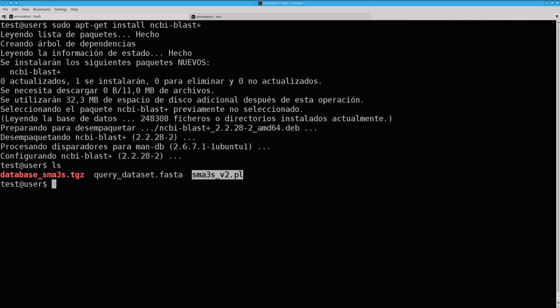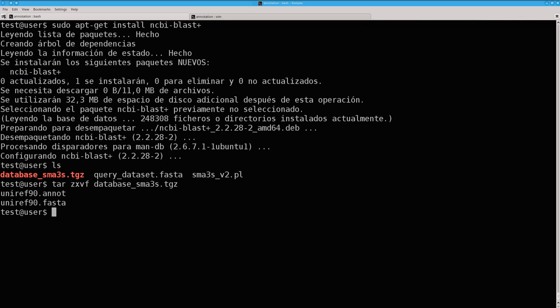Now you have to decompress the database file and make the program executable.